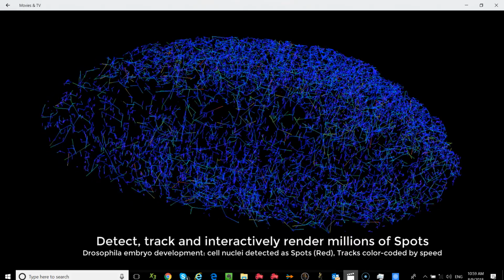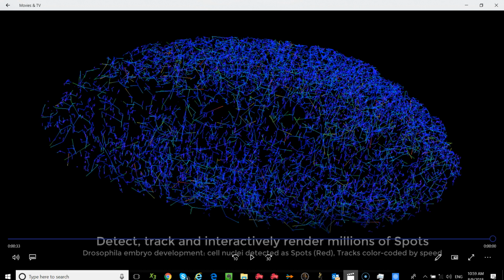Hi. Does this deal with very dense tracking? Say, if the spots get too dense, there's a possibility of connecting the wrong spots. Is there extra coding in there to handle that? Well, that's a little bit of a different question. That's more to do with both spatial and temporal resolution and whether you have enough of it to be able to track those structures. And you're right. When you see embryos growing and changing, typically more cells are formed and they become more densely packed. Depending on both the resolution at which you are acquiring your data and that temporal resolution, that ultimately determines whether we can find that structure and identify it as an object, and secondly, whether we can actually track it. So it's not so much whether Imaris can do it, it's whether we have the resolution in order to be able to do it.